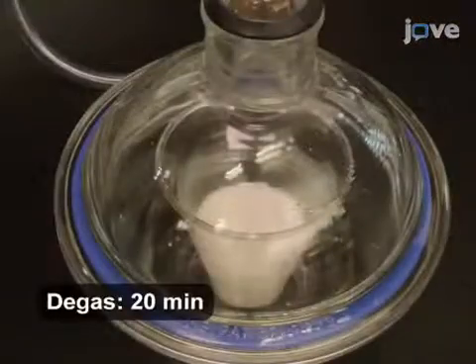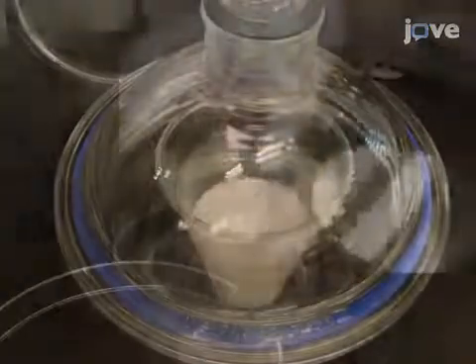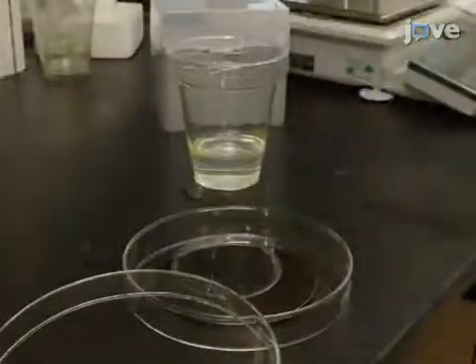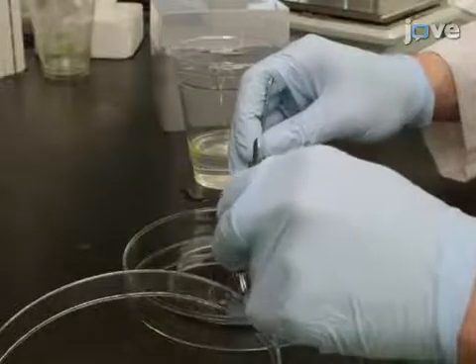Apply a vacuum, but watch it closely to prevent the mixture from overflowing. Once degassed, pour a large drop of the degassed PDMS mixture into a glass petri dish and press the mold onto the PDMS with the template side facing up to avoid trapping bubbles beneath the wafer.